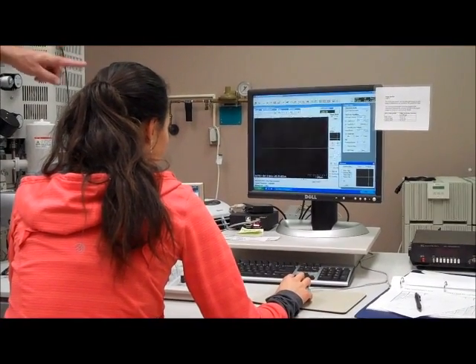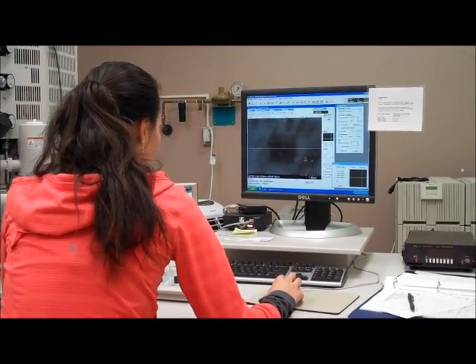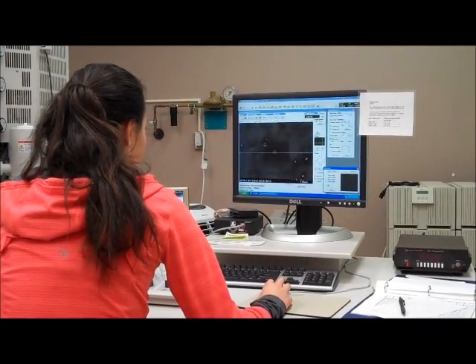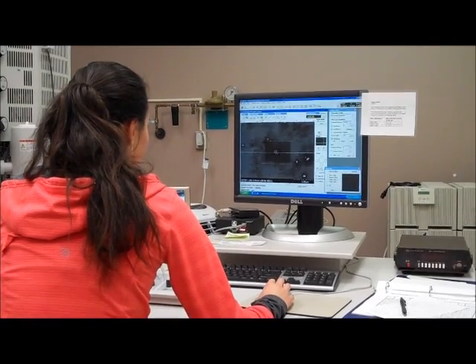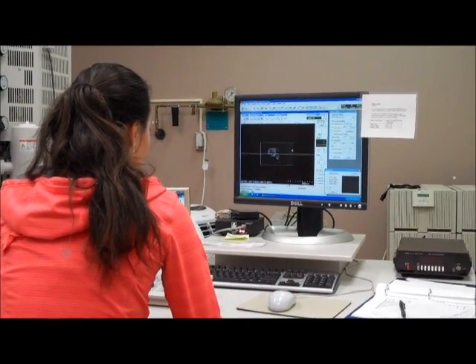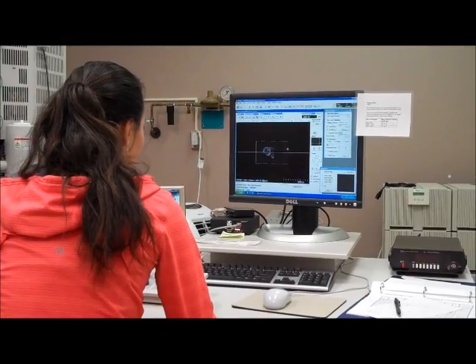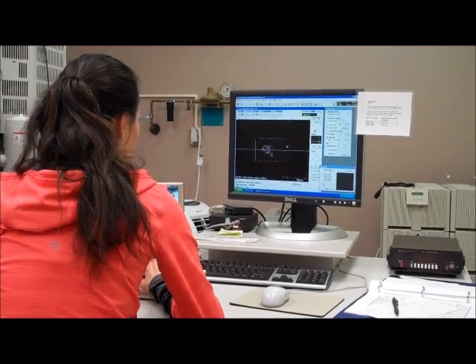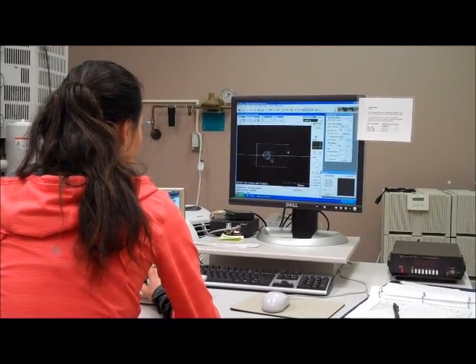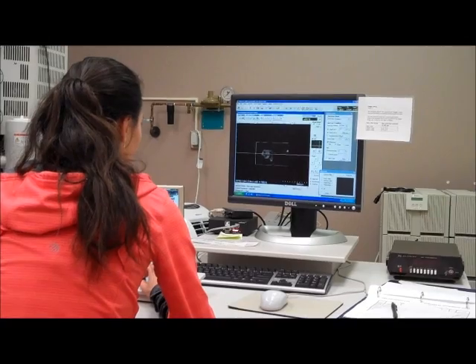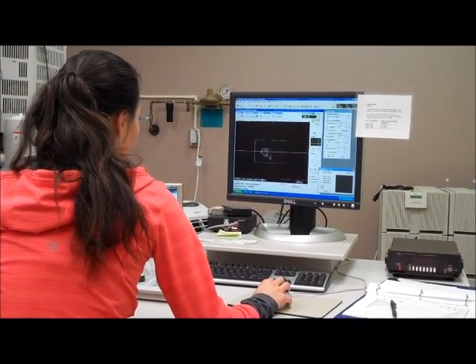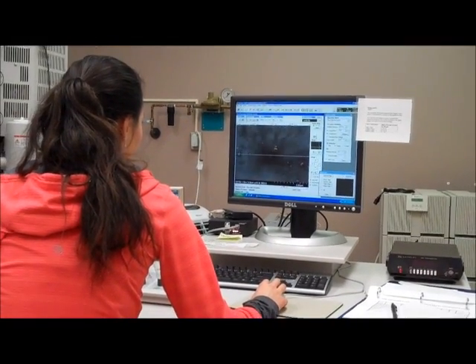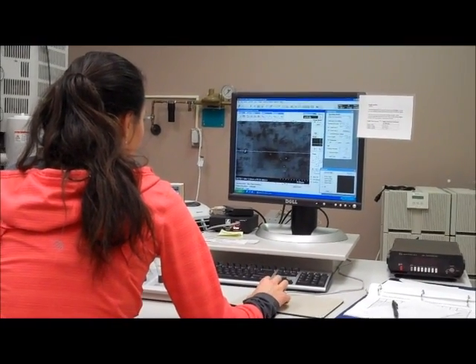So you see how there's a black mark? Right. So it becomes increasingly difficult to image samples where the beam has, so if you let the beam sit in one area, then it'll thermally damage the sample. So sometimes we sacrifice a certain area nearby a particle that we like to measure. So we sacrifice it and go ahead and do all of our alignment on it and then move that particle out of the field and go to the next one adjacent to it and then get our image of that.